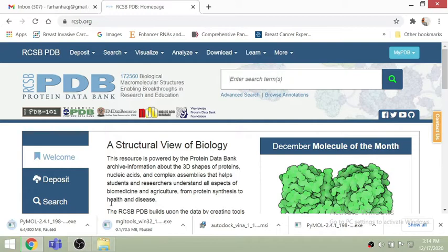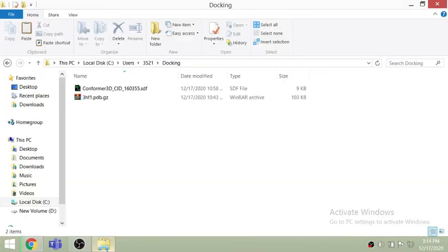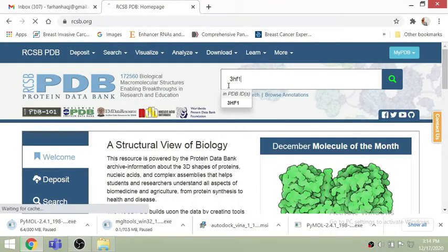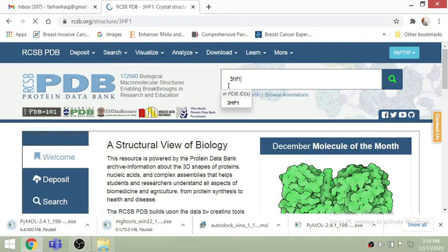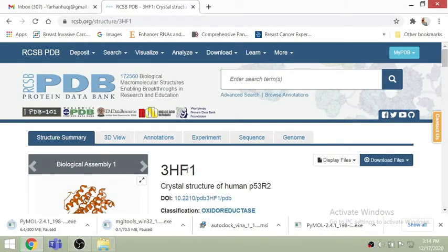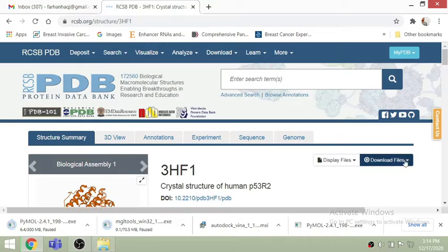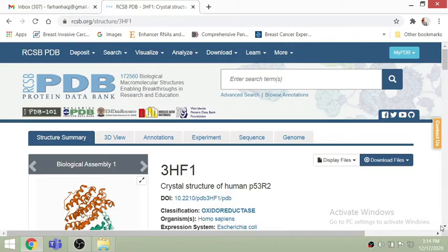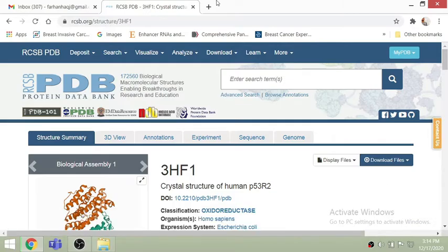I'm just writing a protein name — for instance, here this is 3HF1. I've already downloaded it, but I'm just telling you how to do it. Just write this Protein Data Bank ID and download the PDB structure. It depends on you — whatever structure you are using, you just have to download it from PDB.